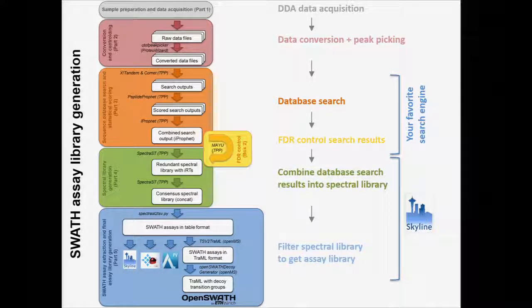What's written in the tutorials is not exactly what I'm describing here, but as we talked about yesterday with OpenSWATH and Skyline, in a conceptual sense they're doing more or less the same thing. Maybe I'll point out one or two places where they do something different, but you can do it either way. The idea of having this more detailed protocol is that you have control at each stage, and you can understand what's happening at each stage.